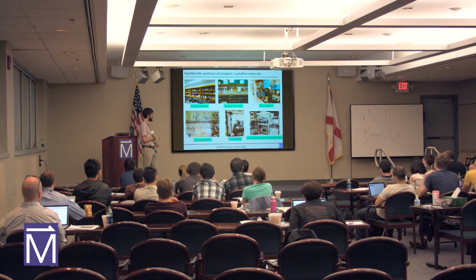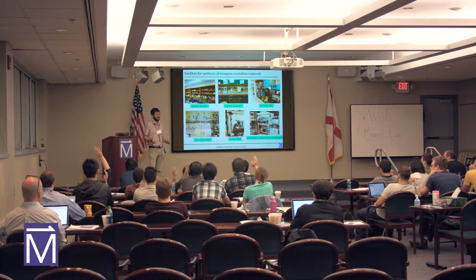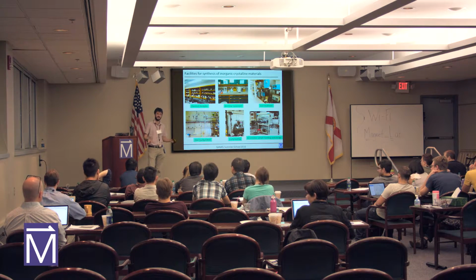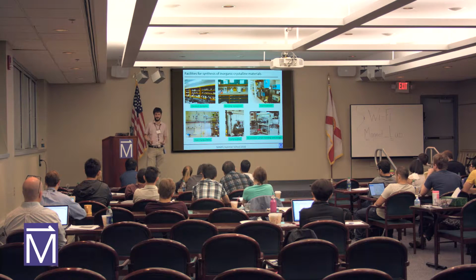We have a quartz bench. How many people are familiar with what a quartz bench looks like? Okay, so I think you'll definitely see it in the practicals, and half of you have already seen it. It's basically an apparatus where you have a plumbing system. You have a very hot torch. Actually, it's right here. This is a hydrogen-oxygen torch. And the flame that comes out of this is hot enough to melt quartz.